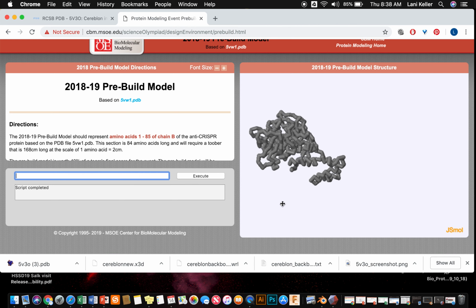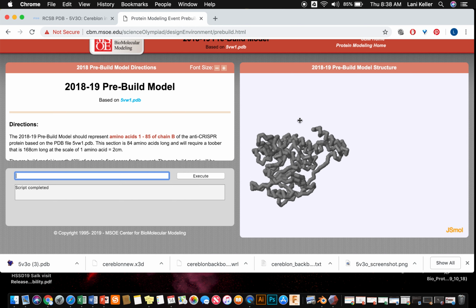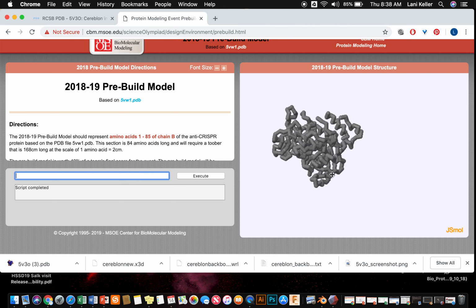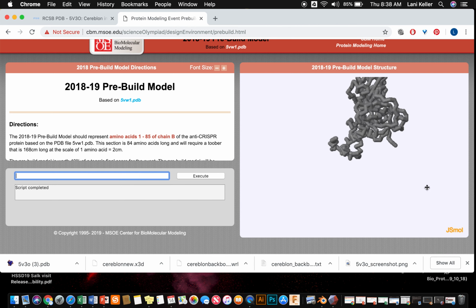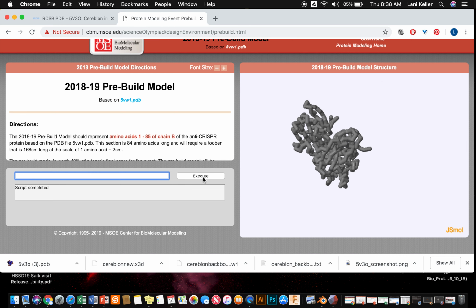So you can see parts of the secondary structure here. I can see alpha helices. I can see right here we have some beta sheets. It gives you a look at your molecule, just at the backbone. So this is another way you can 3D print your protein rather than looking at the surface view.